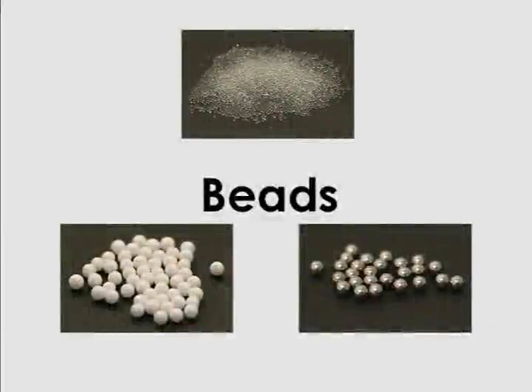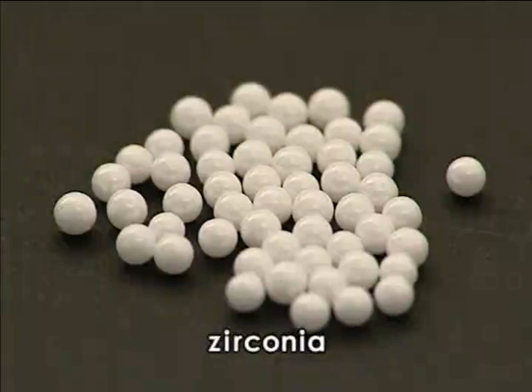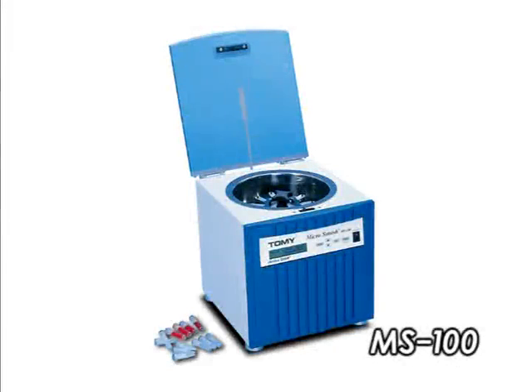This 3D motion allows beads to give a stronger impact on cells or tissues and disrupt them more effectively. We offer various types of beads for the MicroSmash MS100, made from glass, zirconia, and stainless steel, in different sizes to meet your specific application needs.